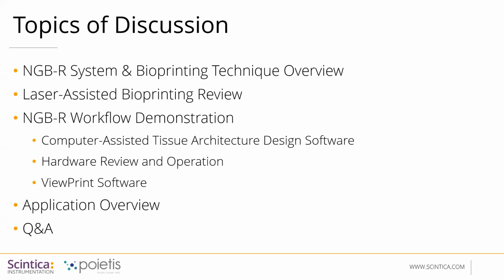As I mentioned earlier, today I'll give a brief overview of the NGB-R system to help those of you who didn't attend the previous webinars to get a little bit caught up on the features and the hardware. Then we'll move on to a brief review of the laser-assisted bioprinting, which Antoine will give. Both Antoine and Michael will talk about the workflow of the NGB-R system, starting first with the CAD software, and then we'll move into a hardware review and show you some videos of the system in action, and we'll finish up with a look at the ViewPrint software.